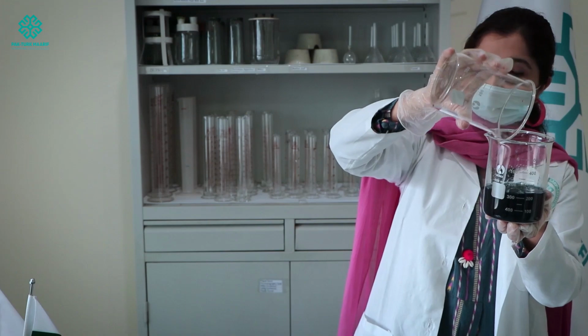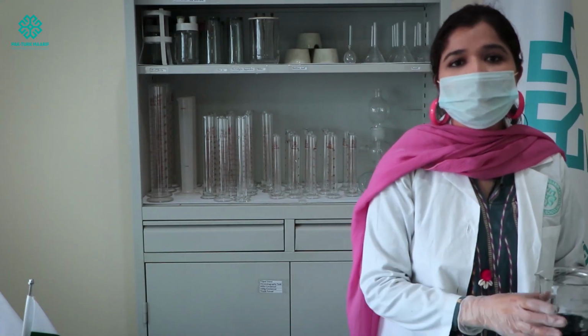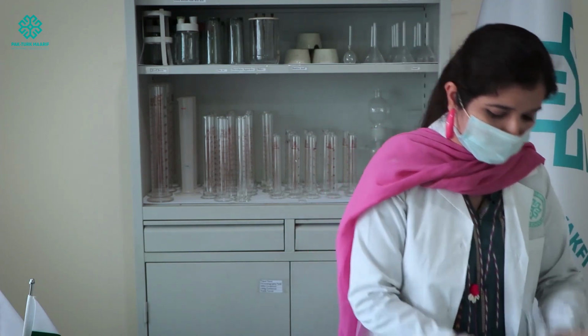And why is it so? Actually, it is making a complex. This is transition metal chemistry, and here the iron is making a complex with the cyanide ions and the potassium. This changes its chemistry along with the oxidation state, and you are noticing the change in the color of the solution.